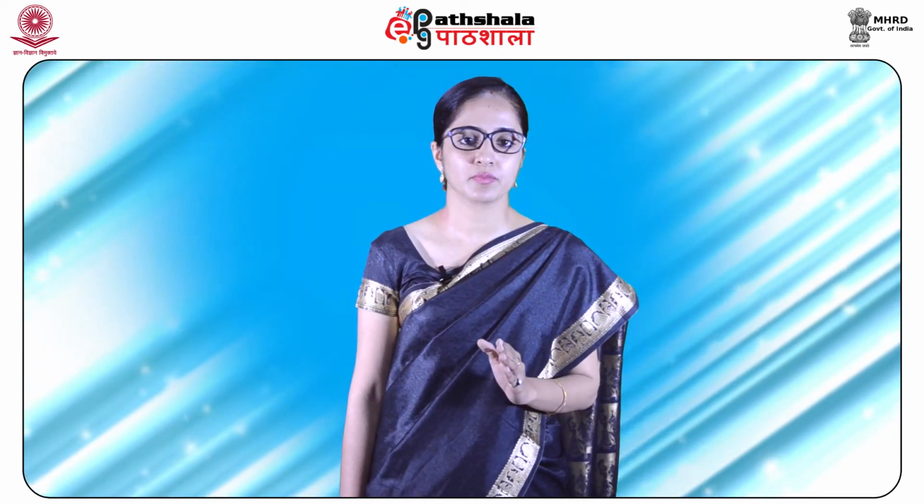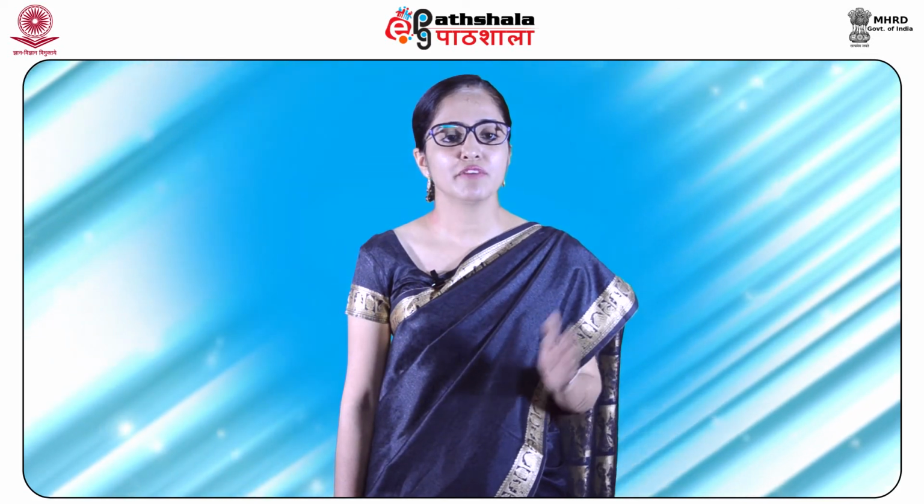A proton is called shielded when more electron density is surrounding it, and deshielded when less electron density is surrounding it. So students, these few factors which we have described in detail in this module will form the basis of determining the NMR spectrum for an unknown compound, and they are routinely used by organic chemists to identify unknown compounds.